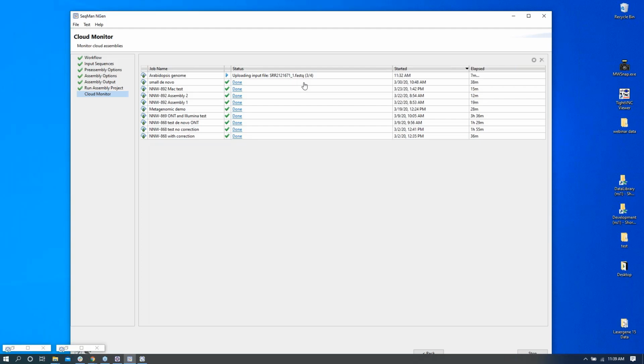And right then, Sharon, you can see here on my cloud monitor that it's now on the 3rd file of the 4 files. Wow, in just 7 minutes. Yeah, it's really a robust protocol. So the zipping and then the upload that we use for this cloud data drive is really, really good. I've done hundreds of gigs of files using this uploader. So it's really robust.